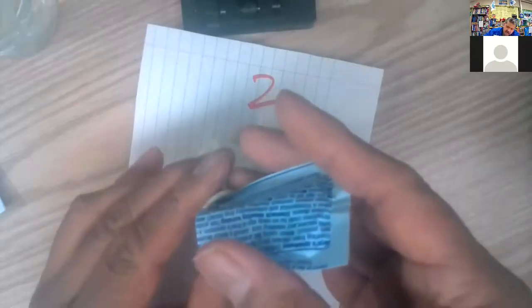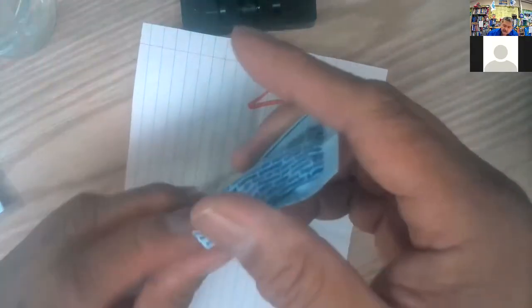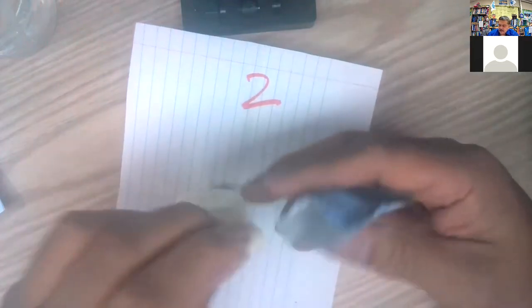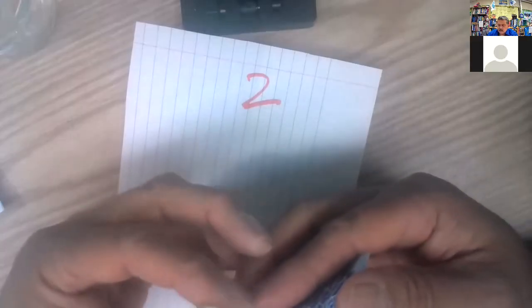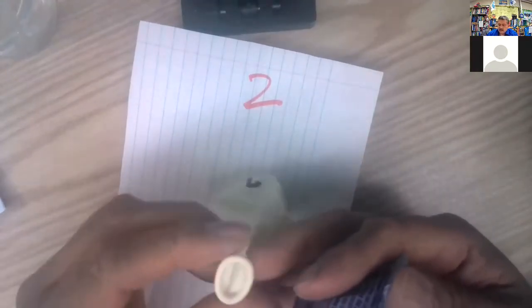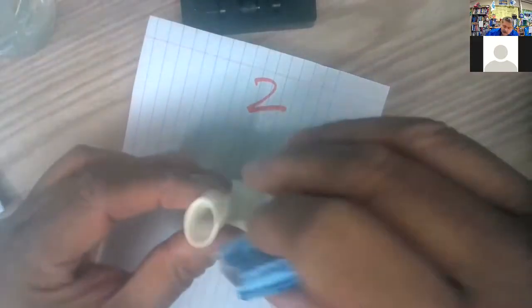All right, still getting the rest of the powder in. You see there, I got just about all of it. I'll try to get everything because we want to minimize the variables, right? So I'll try to make everything the same as much as you can. So we're gonna try to get all that powder in there. Even though this is a qualitative lab, we still want to minimize the variables in a scientific experiment. So still coming out. Oh yeah, I can still see it. So keep trying on that.